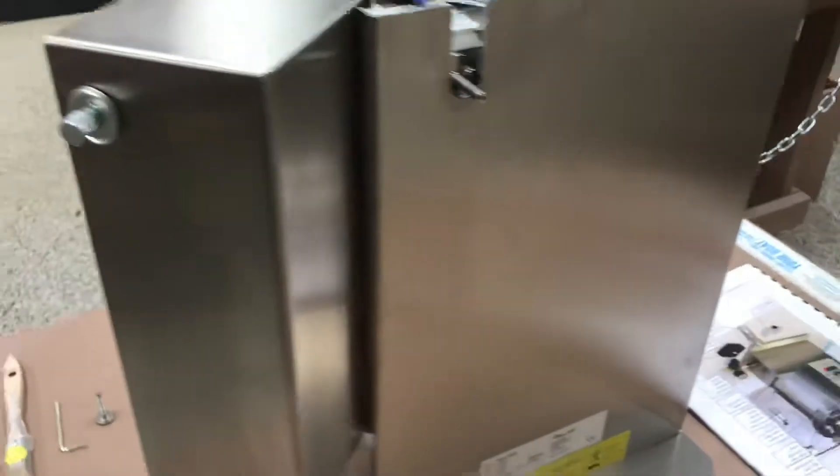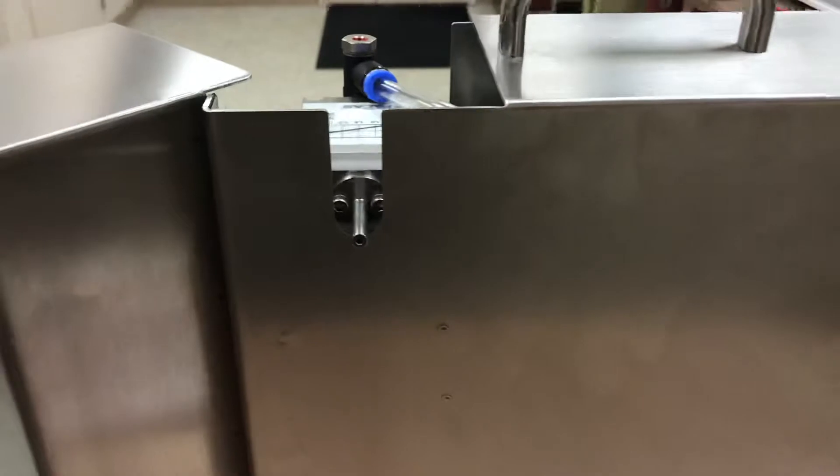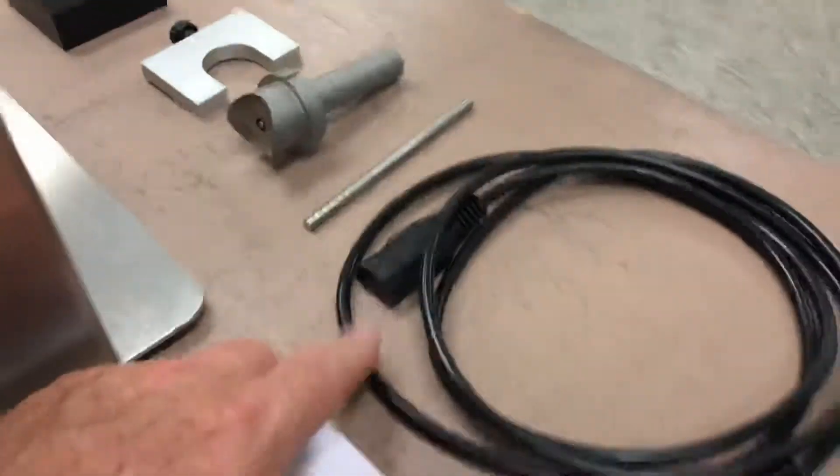Coming around the back, the only things here are the label at the bottom and the air exhaust at the top. On the side we have the main power switch. This unit is set for a 115-volt power cable, which they do supply.